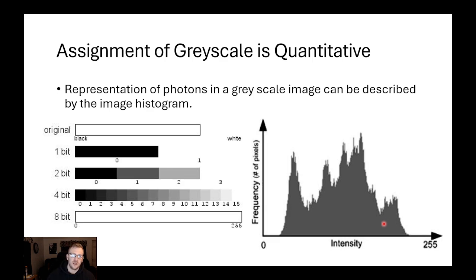So maybe, we'll use easy to understand numbers, we had 100 proteins localized into a 1 micron spot. So those were all detected by the same photodiode, because remember our photodiode is 6.5 microns wide, and we had 100 proteins localized within a 1 micron spot. So all the photons from that one spot were collected by the same diode and generated a really strong electrical current, which made that pixel really bright.